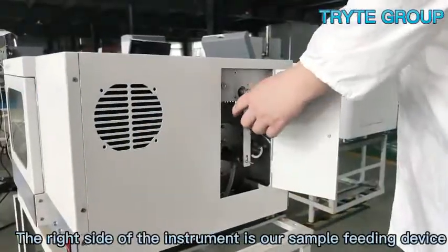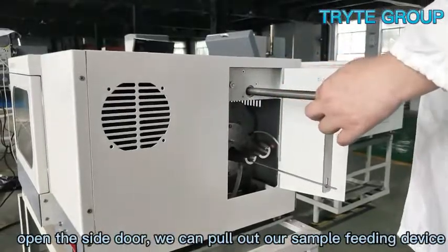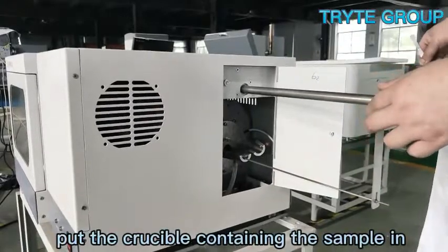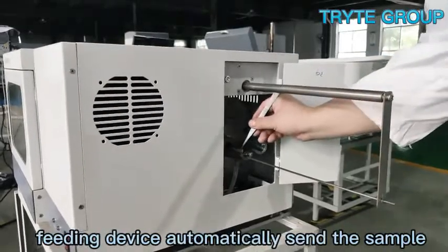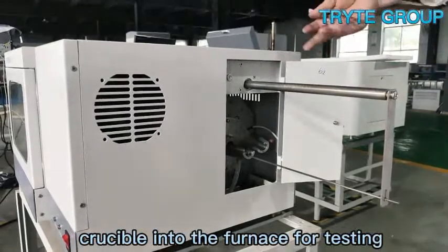The right side of the instrument is our sample feeding device. Open the side door and we can pull out the sample feeding device, place the crucible containing the sample in, and operate the computer program to let the sample feeding device automatically send the sample crucible into the furnace for testing.